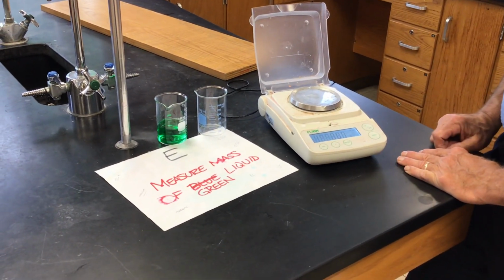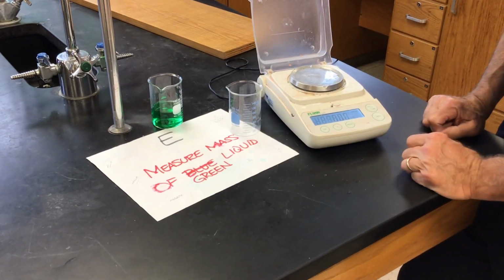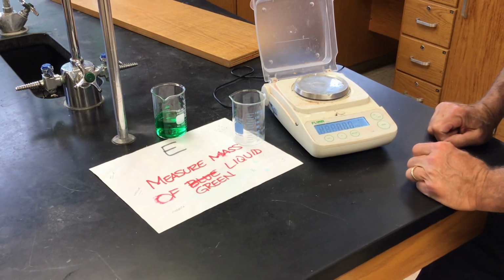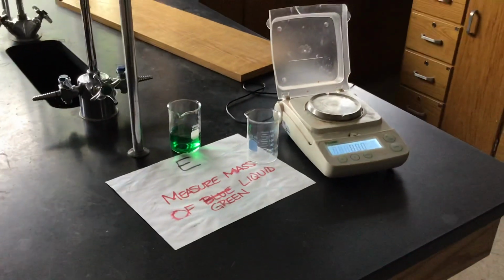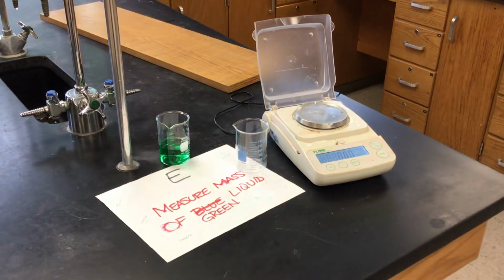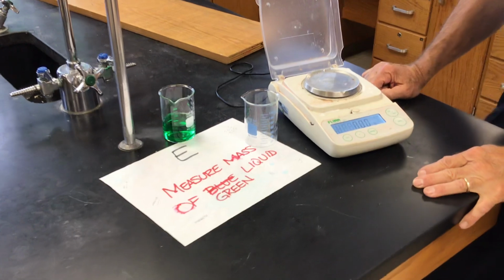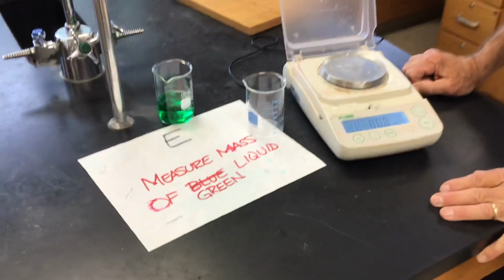I wonder how I can accomplish this. If we just pour that liquid right on the balance, you think it'll all sit there and let us measure its mass? Oops, we lost the lights. Hold on. We can see fine. It's all right. I'm guessing that's not a good plan, Mr. Moore. I think some of it'll roll away. So that is not a plan.